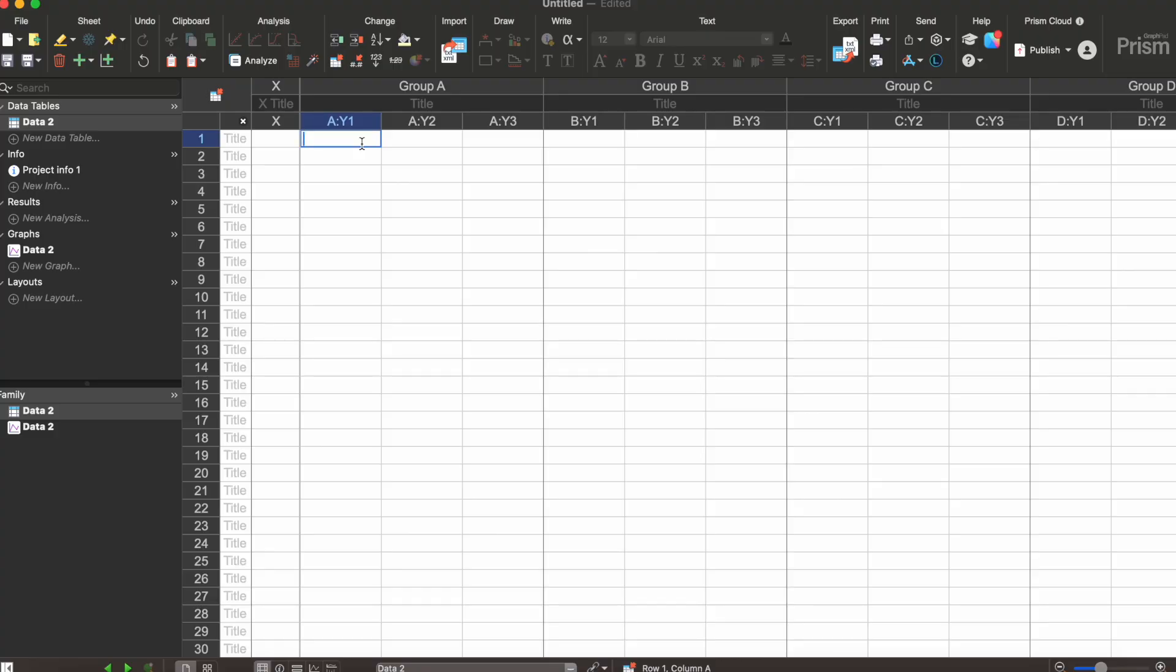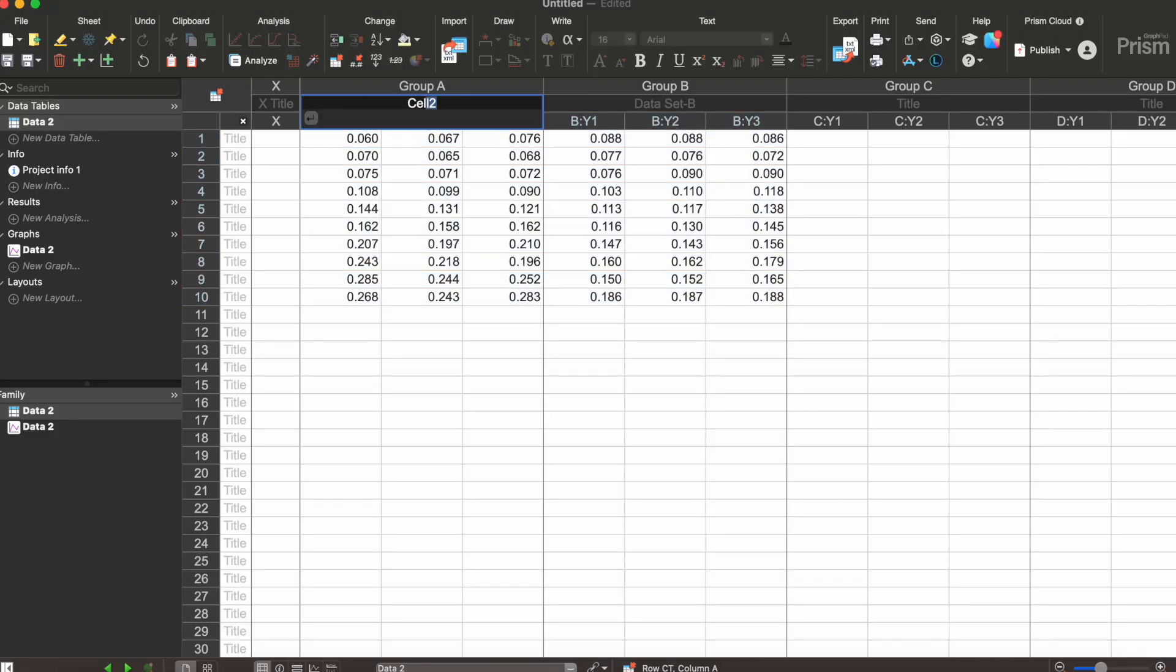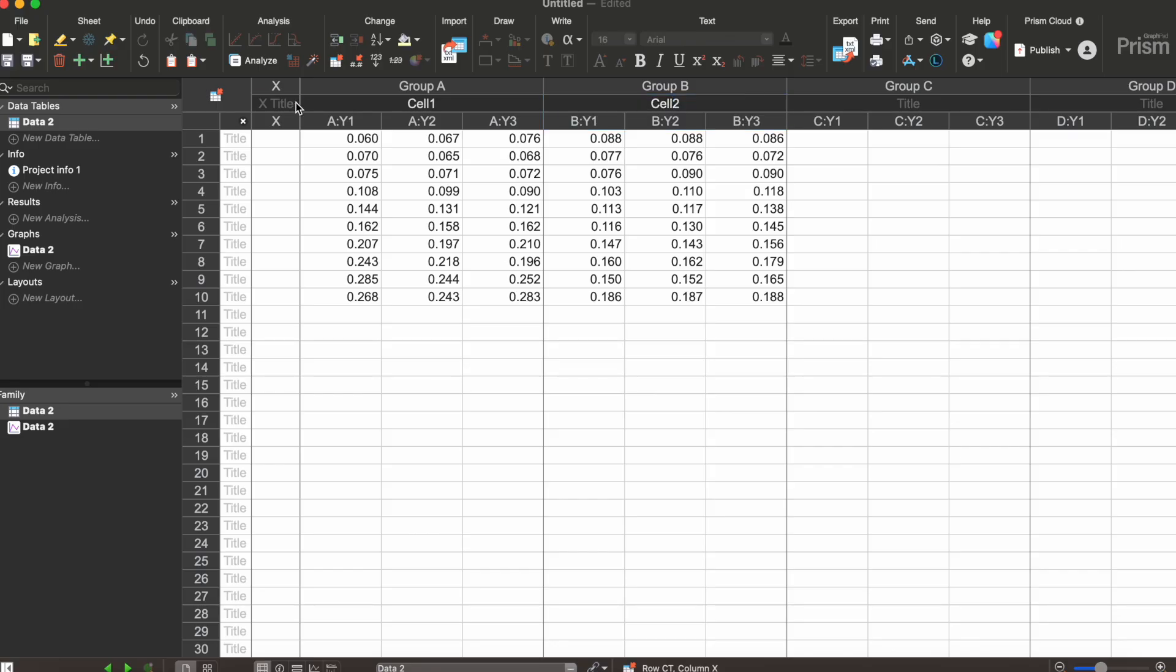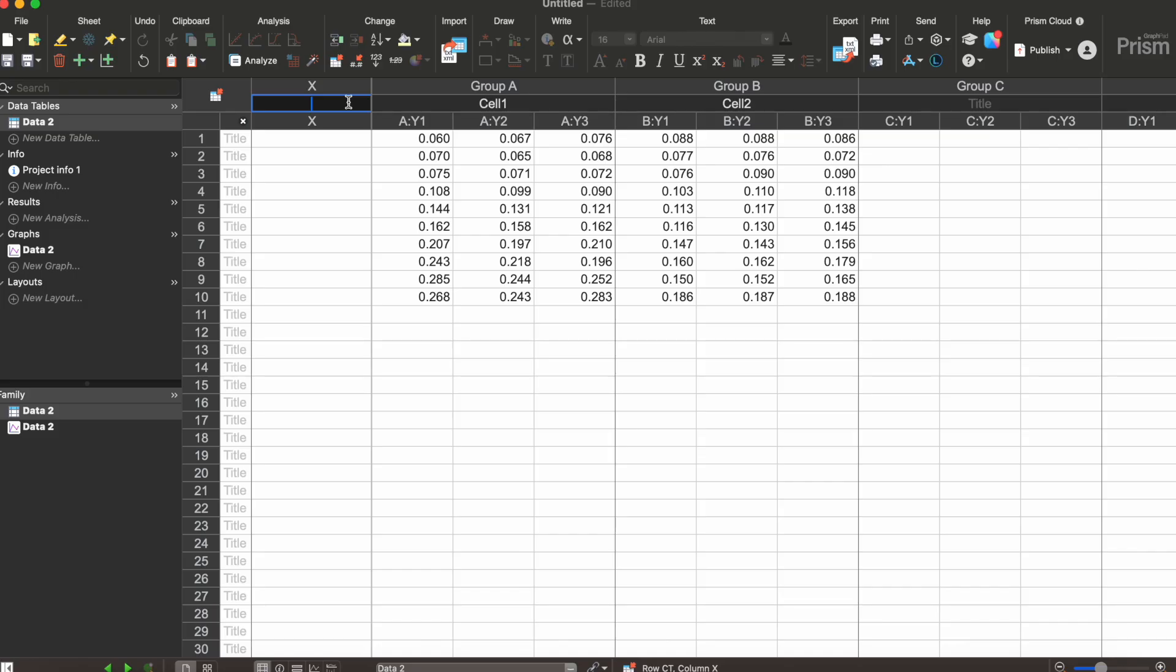I'm gonna paste my values here and we're gonna call this cell 1 and then this is cell 2. In the X column here I want to put cisplatin which is the drug of choice used in this experiment and then we're gonna put the serial dilution that I used in the experiment.